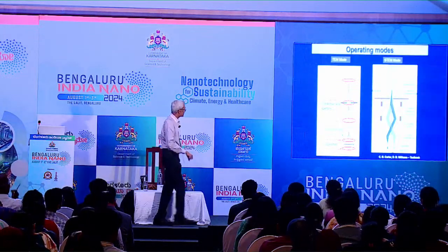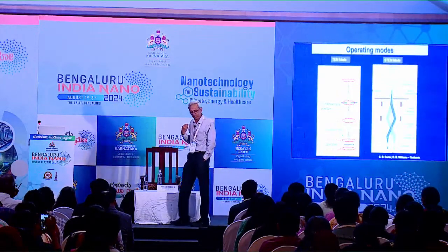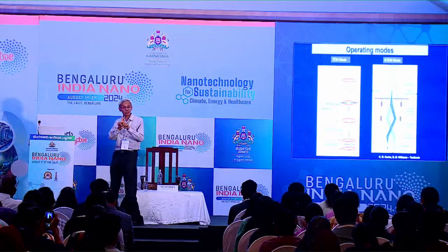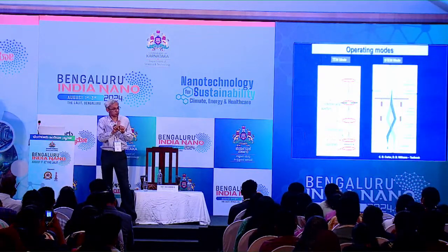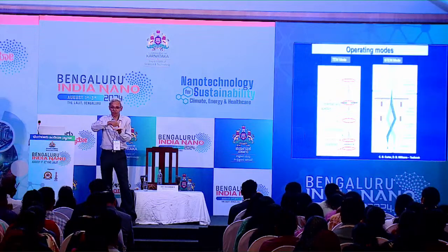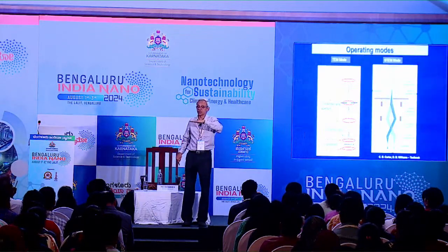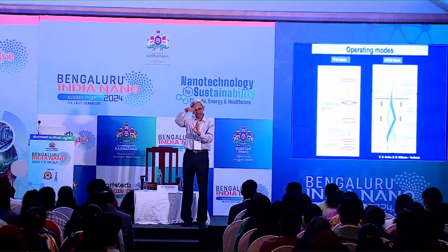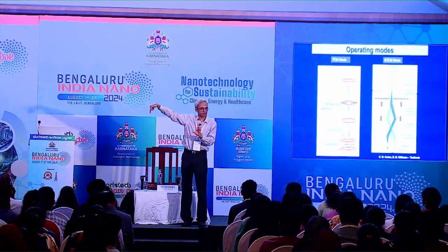Okay, so the STEM mode has become very, very popular because of the aberration correction in particular that I told you about. It is now possible to get sub-angstrom or angstrom size probes that can scan on the sample surface and get information point by point. If you have a suitably oriented crystalline specimen, we can actually look at individual atomic columns in a specimen.